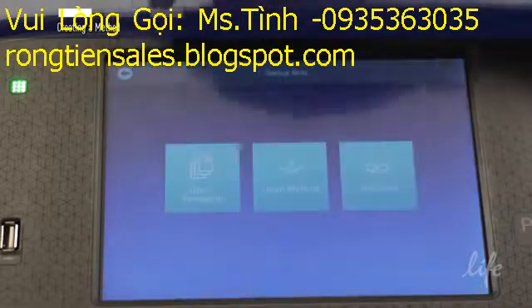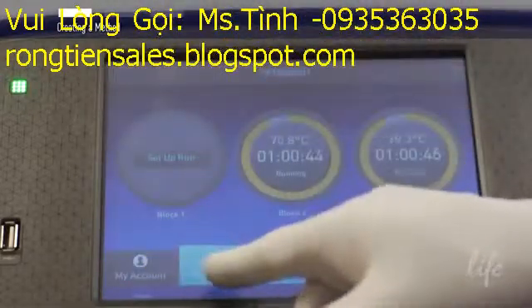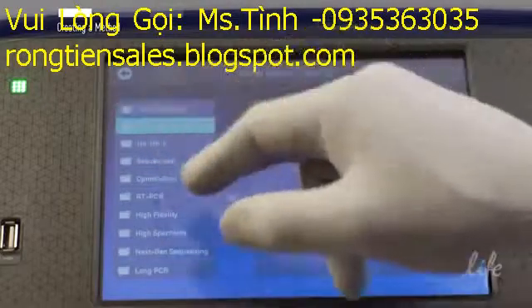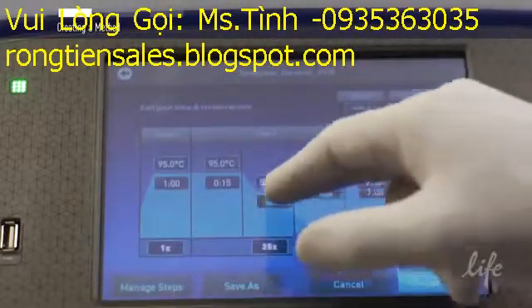If you have not created any method files yet, you can select new method to design your own protocol or choose from a list of preloaded methods. Enter your cycling conditions, temperatures, and times.